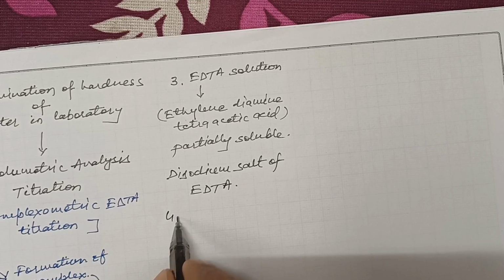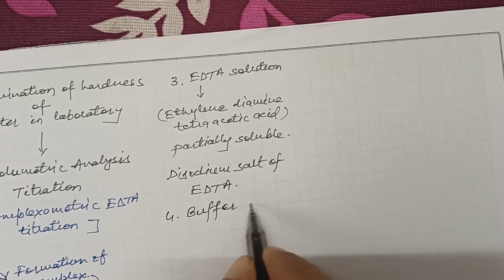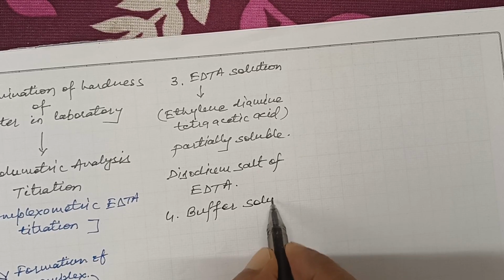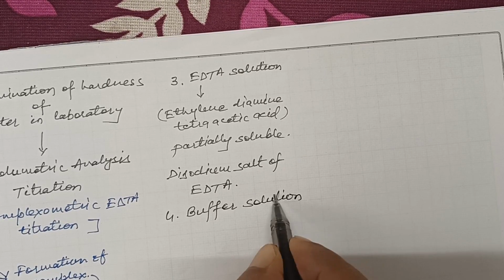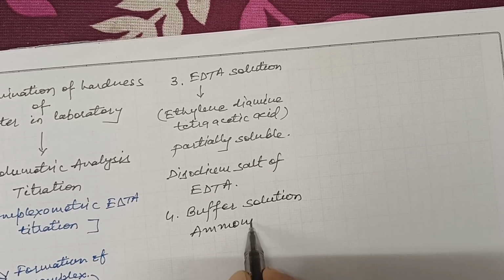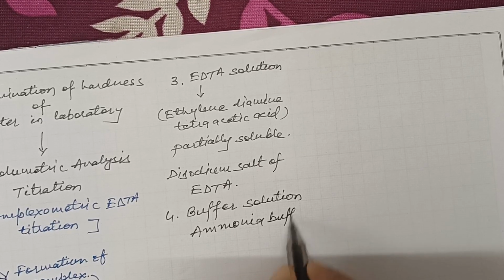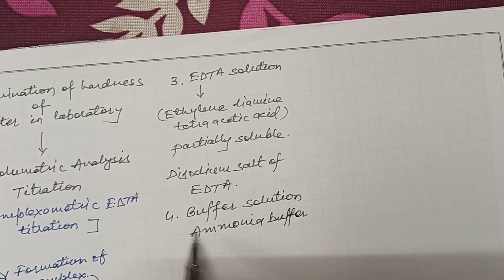The fourth requirement is buffer solution. We use ammonia buffer for this practical.